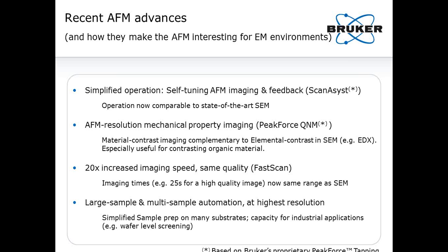The first AFM were operated in contact mode, in which the AFM tip simply slides across the sample surface while a set tip sample force is maintained. Most of today's AFM are operated in tapping mode, in which the AFM cantilever is driven into oscillation by a small actuator and the dampening of the cantilever by the surface is used for feedback. This is advantageous as it reduces lateral tip sample forces and provides some material contrast by displaying the variations of the dampening-induced phase shift of the oscillation.